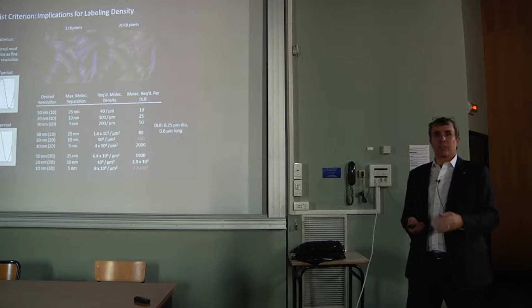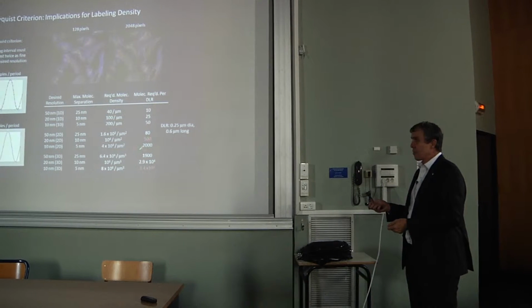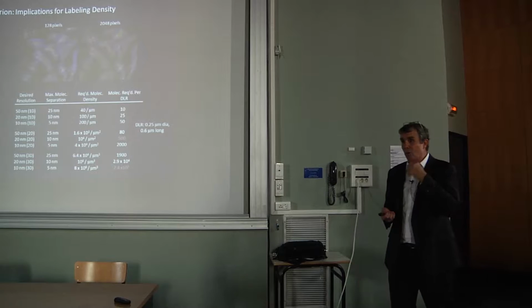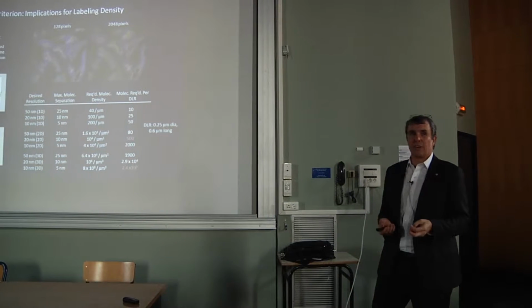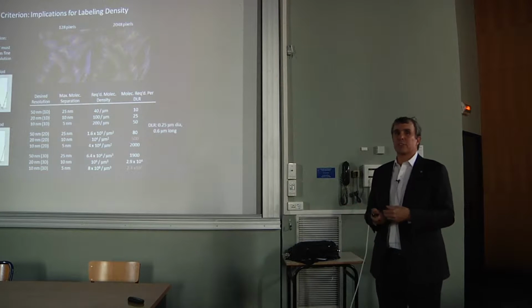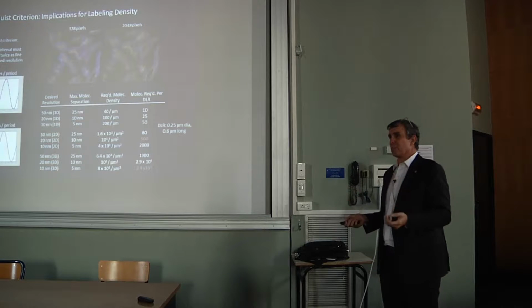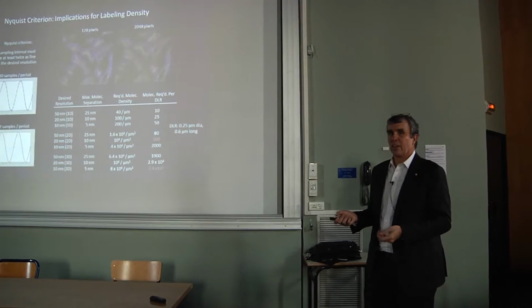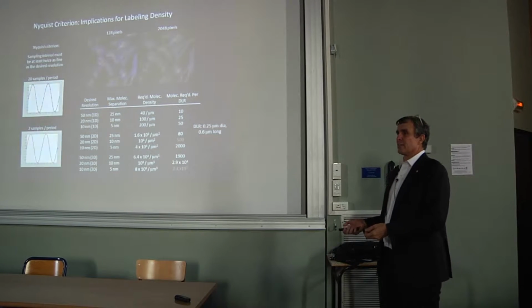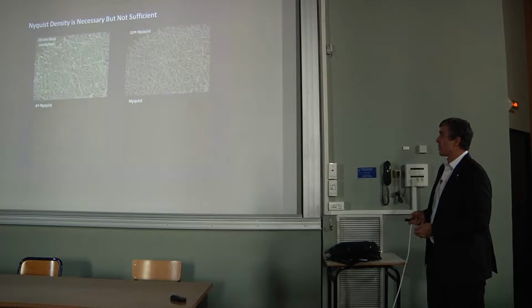That's doable with the on-off contrast ratio of fluorescent proteins. But what's hard is to get 500 in a diffraction limited spot. Because normally, when you transfect cells or otherwise label cells at the diffraction limit, you're working at much lower levels of labeling. So a lot of the onus to get these super resolution techniques to work well isn't so much on the instrument developers anymore, it's on the biologists who do the sample preparation. And it's really difficult to do that properly.